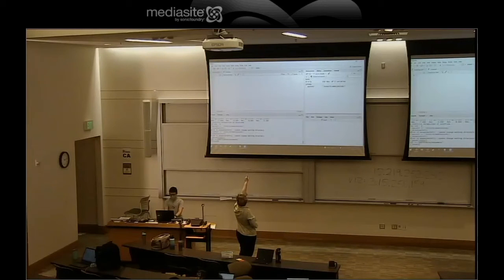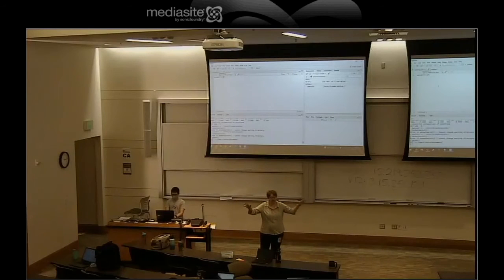So do it up in the script part. Oh, in the script. Yeah, there we go. Okay, so at the moment when something is in your script, it has not yet been run. It's just sitting in your script waiting to be run, okay? You can run the same command in your script as in the bottom. That's true for bash too.